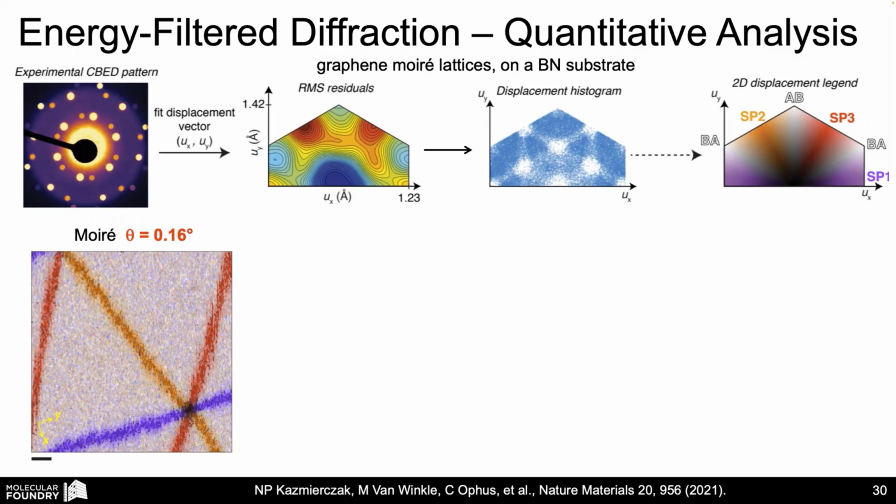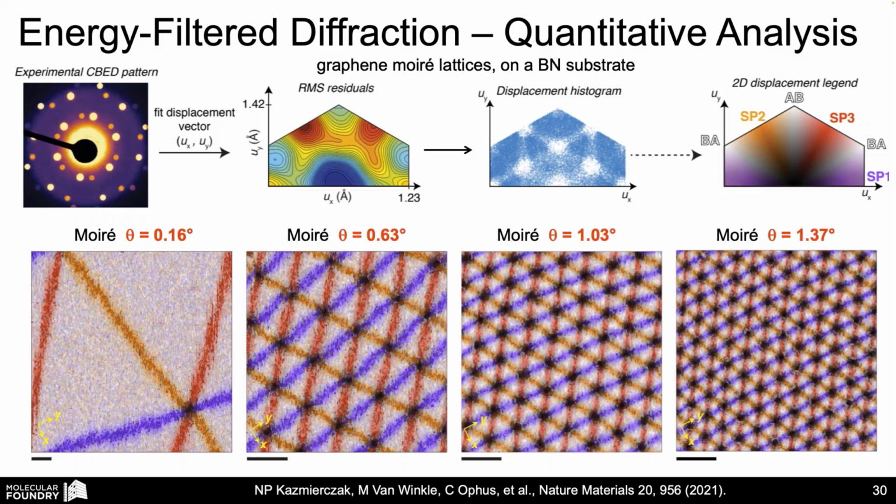And so we can measure the sort of expansion of the white regions, the favorable AB or BA stacking of our twisted bilayer graphene. And then in between, you can see it's bordered by saddle point stacking sequences. And the sample acts with local deformation to minimize the black regions, the AA or BB stacking, because it's extremely unfavorable. We can do this as a function of moire twist angle here, and then identify the different relaxation mechanisms in this material. Because from these dislocation or deformation or displacement fields here, with a little bit of work, we can differentiate them, and that recovers the strain field of these materials. So the relative deformation of the 2 graphene sheets with respect to each other.